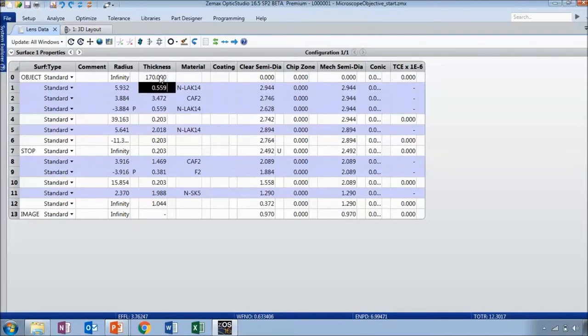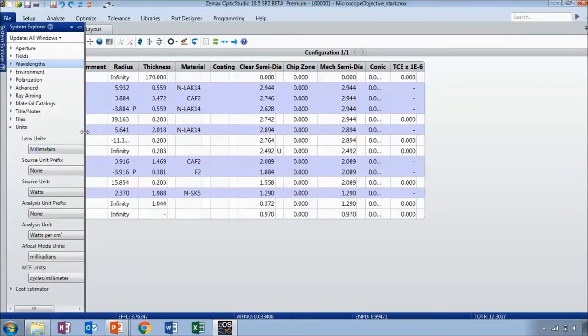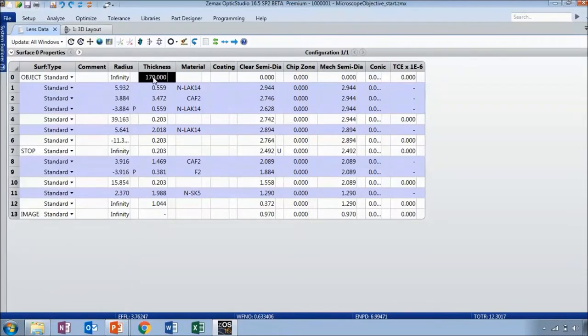I know that this is in millimeters because if I look in the system explorer under the unit section, my units are in millimeters. I also need to change the field settings, wavelength settings, and the system aperture settings because I need to define a bit of system aperture margin.